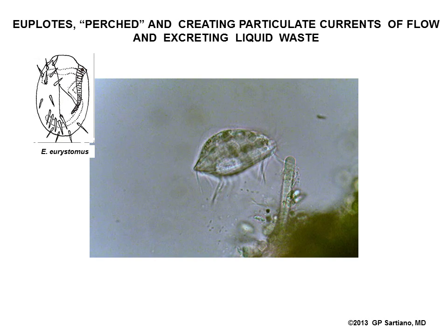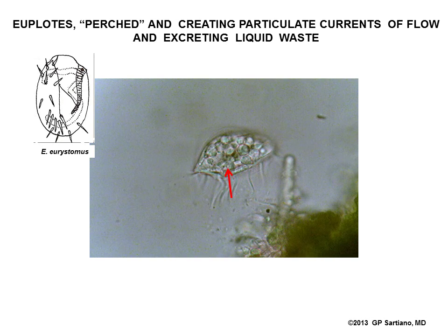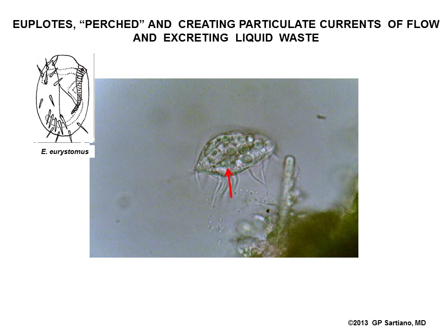The second arrow points to the location of the contractile vacuole, which can be seen to both fill and empty during this video.